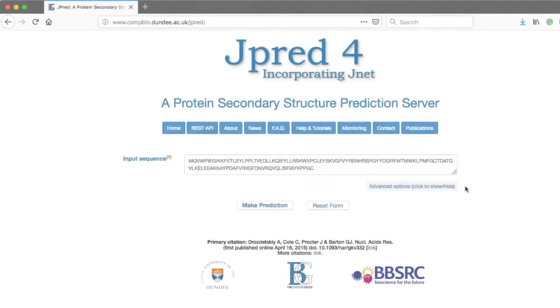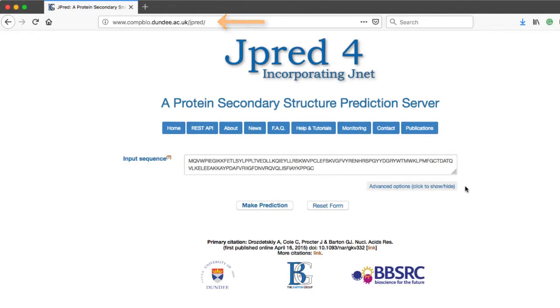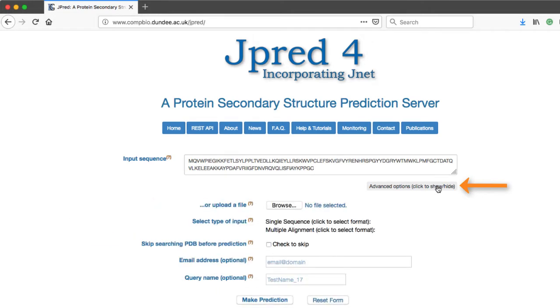The JPRED 4 website can be accessed using the URL on the screen. Multiple sequence alignments must be submitted using the advanced option route. Access it by clicking the advanced option button, which expands the window.